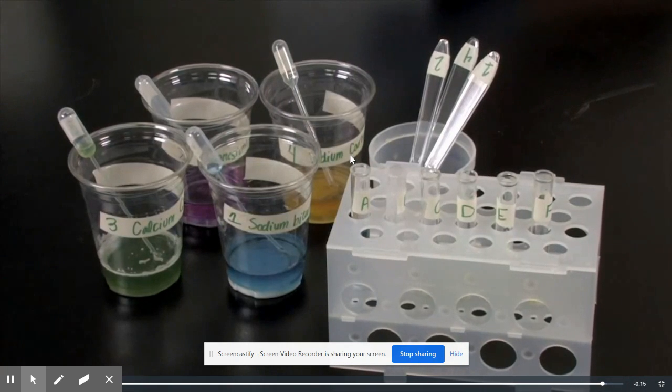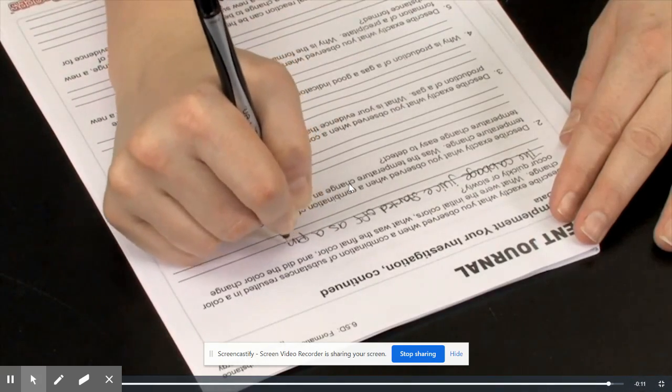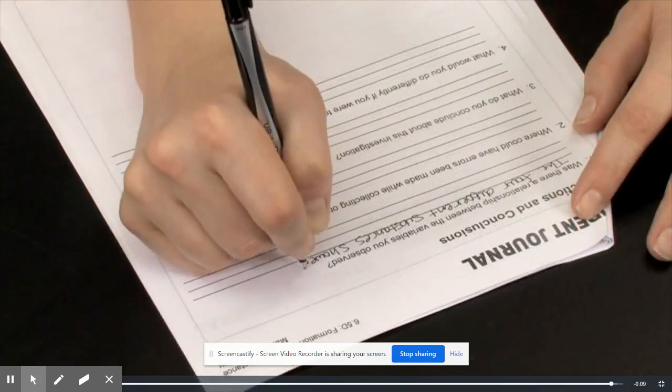Make sure the students dispose of the chemicals properly. Students will then complete all remaining questions.